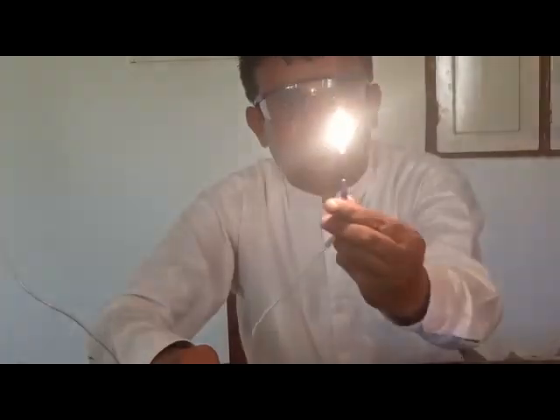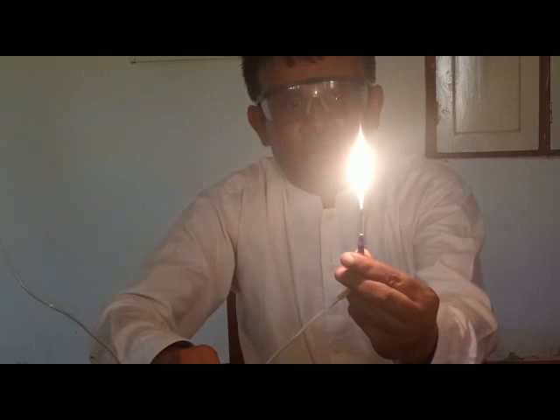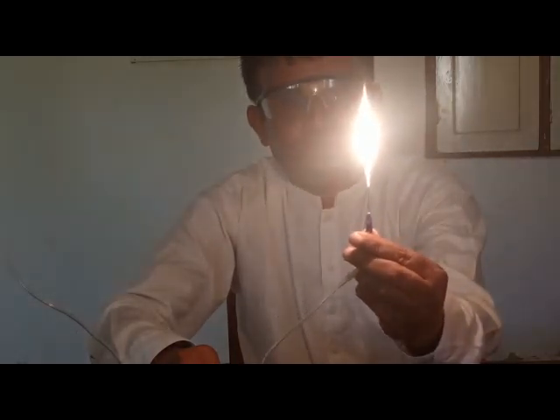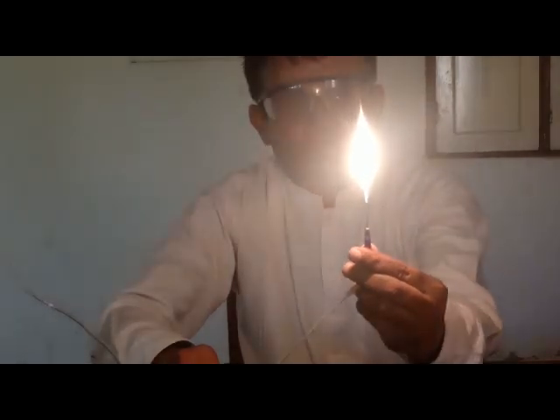Fantastic. Great. And there's also a garlic smell.